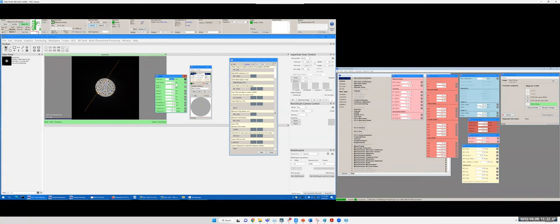Okay, now I want to make sure defocus is still correct. So I want to go to real zero defocus. Now we can choose to hand tune or not hand tune. I prefer to correct the astigmatism by hand tune, to make sure the Ronchigram looks liquid-like at zero defocus.